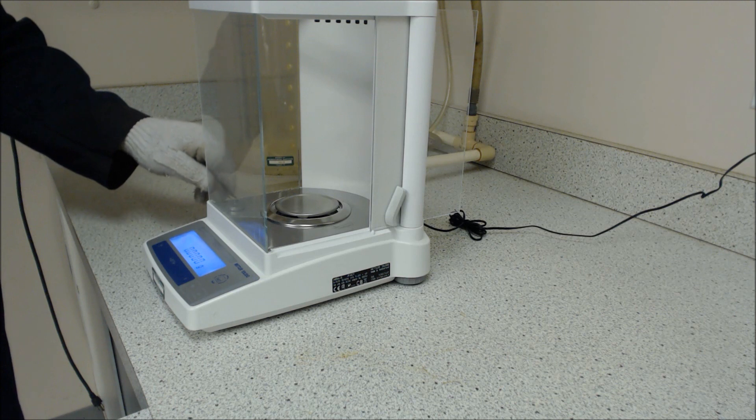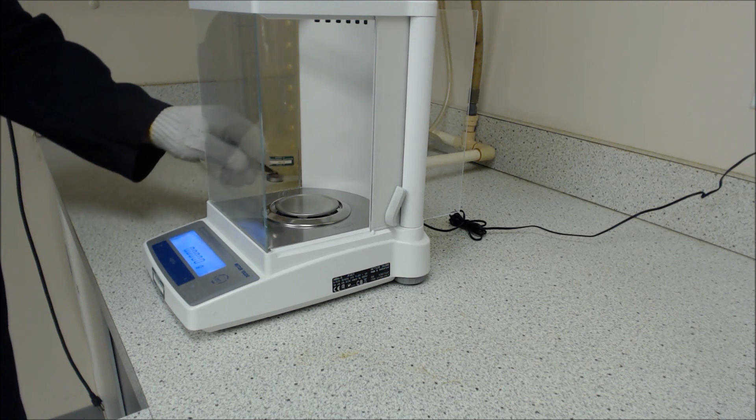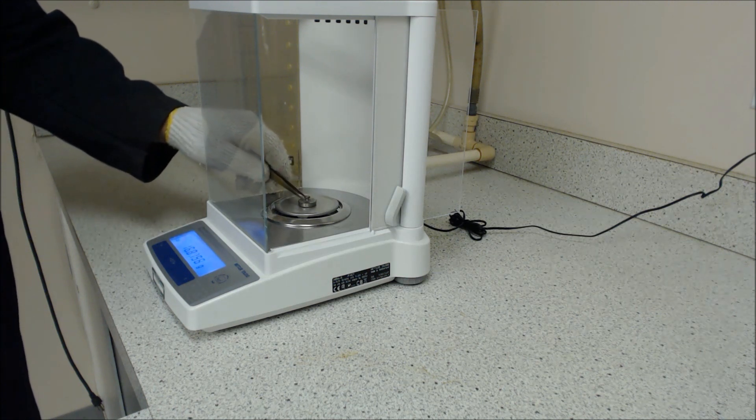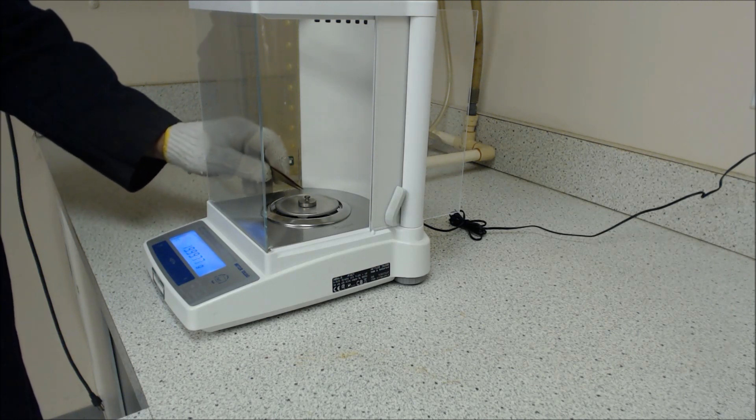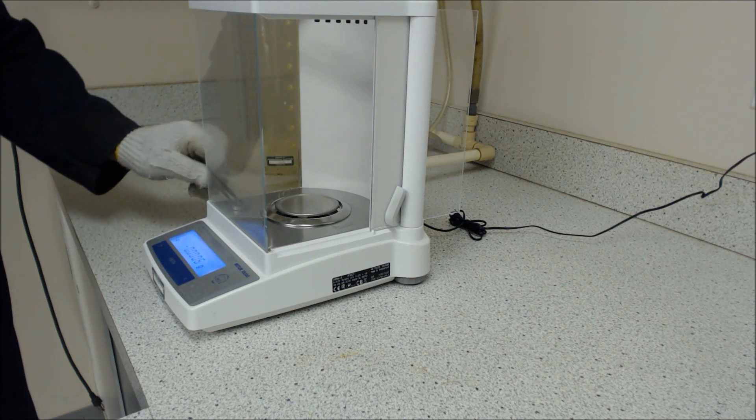We're here with the analytical balance. First, we need to verify it. We have a mass of 20 grams and it's right on. The verification of the analytical balance is checked.